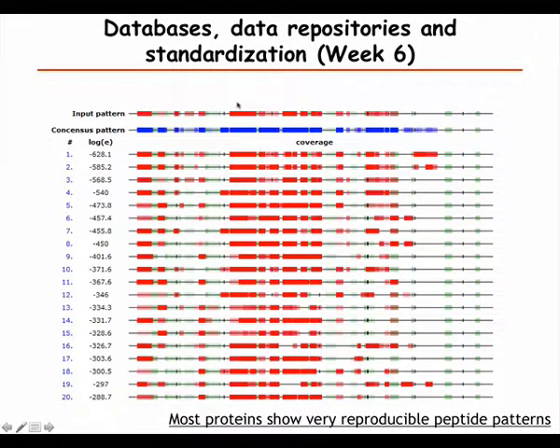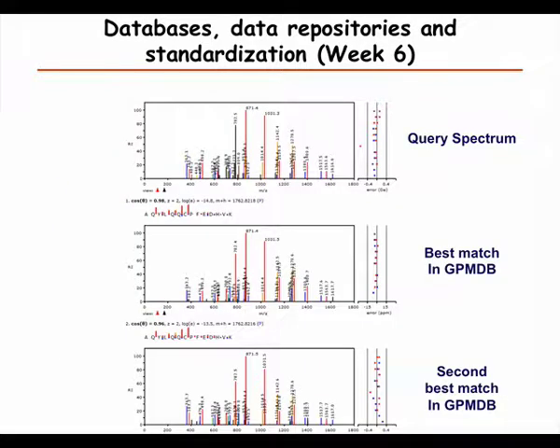This is very good in the sense that if you have an experimental observation, you can compare it and see whether it is very different from everyone else's. If you have done your experiment in a very different way, that's fine. But otherwise, if you haven't, then something is probably wrong with your experiment.